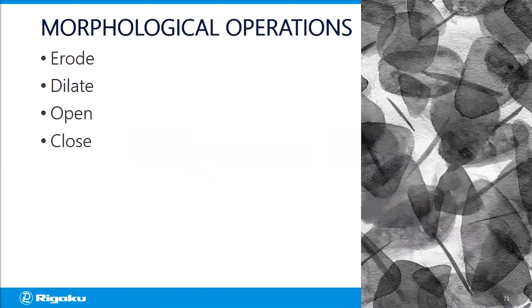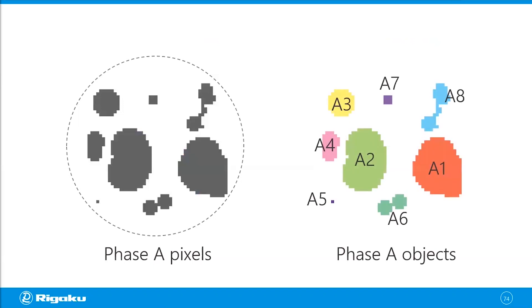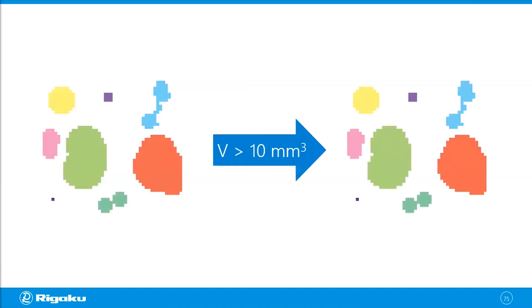Those are some basic operations to optimize or clean up segmentation. Another technique: say you've got pixels labeled as phase A in different groups. You can label them as separate objects — say eight objects belonging to phase A — then check their individual volumes, locations, or surface areas. You can use those parameters to filter out objects you don't want. For example, set a threshold that the volume must be greater than 10 cubic millimeters, and small objects would be filtered out. This is another way to clean up segmentation.